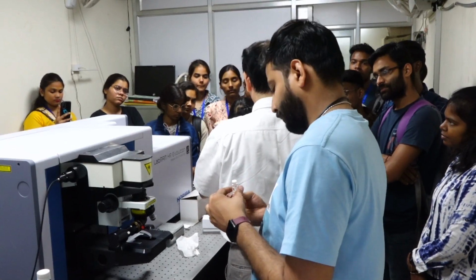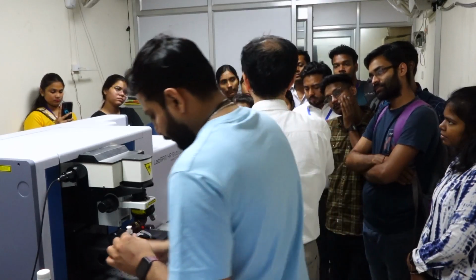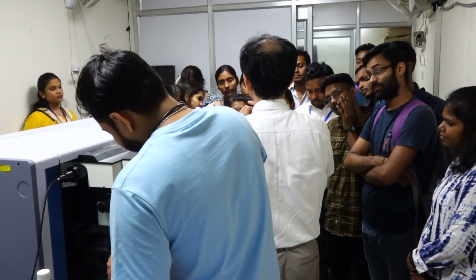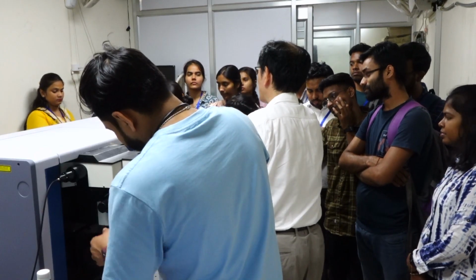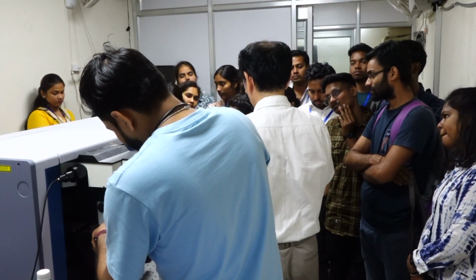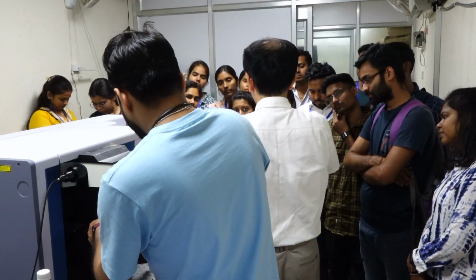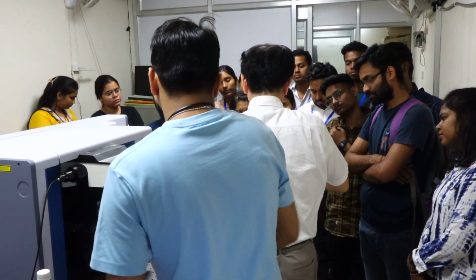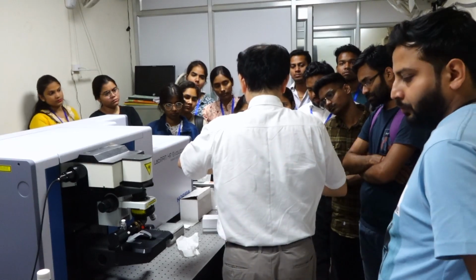I explained the Raman intensity. Raman is in proportion to I0, the incident laser power. So laser power is already fixed by the laser output. If we focus the laser beam in this area, the density of the photon is a certain value.